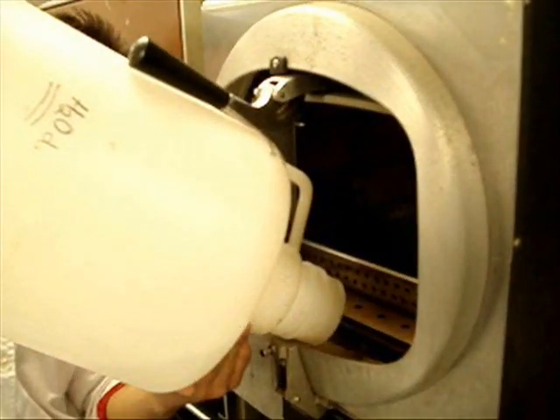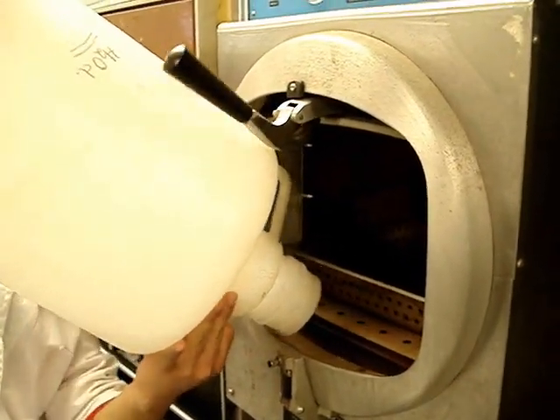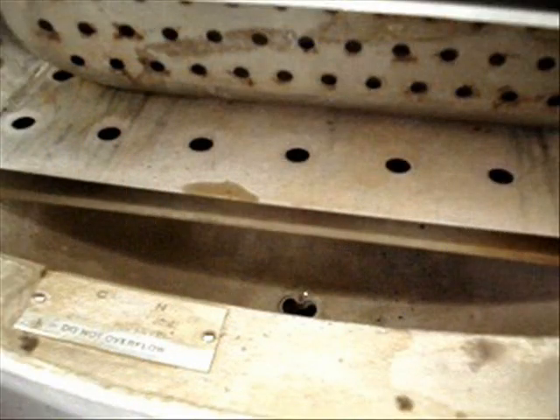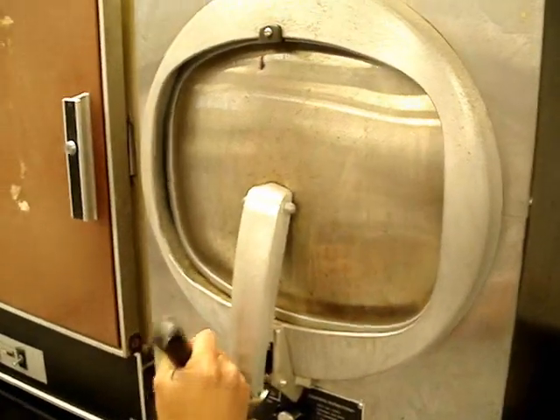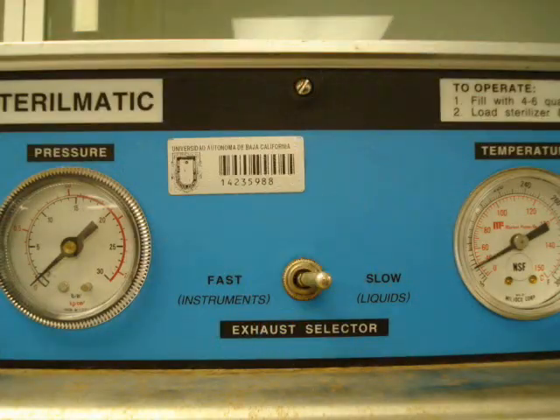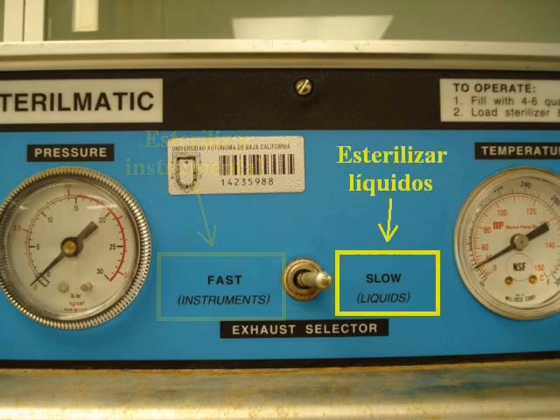The water added to the Autoclave should be distilled to avoid mineral buildup. All checks should be done before using the Autoclave. The pressure regulator has two options: fast, to sterilize instruments where pressure builds almost immediately, and slow, to sterilize liquids where pressure builds gradually.